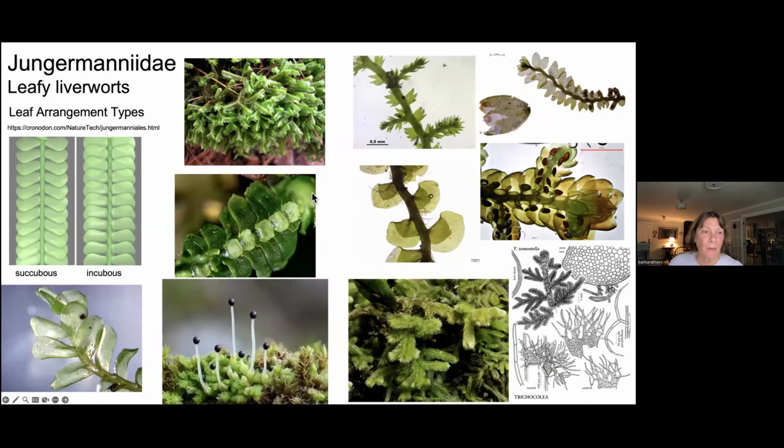The leafy liverworts are much more diverse. We were talking about this a little earlier: you have a stem and you have leaves along it in two or three ranks. Two of those ranks of leaves will be identical, and they'll not be exactly parallel to one another; they'll be offset. They do go around the stem in a pattern, but they're all lined up within each row. When you look down on the top of them, you see three rows only, or two, because this third row of leaves may be absent. Here's a stem where there is no third row of leaves, and here's one where there is. Sometimes that third row looks identical to the lateral leaves. Sometimes it's very different, as in this case.